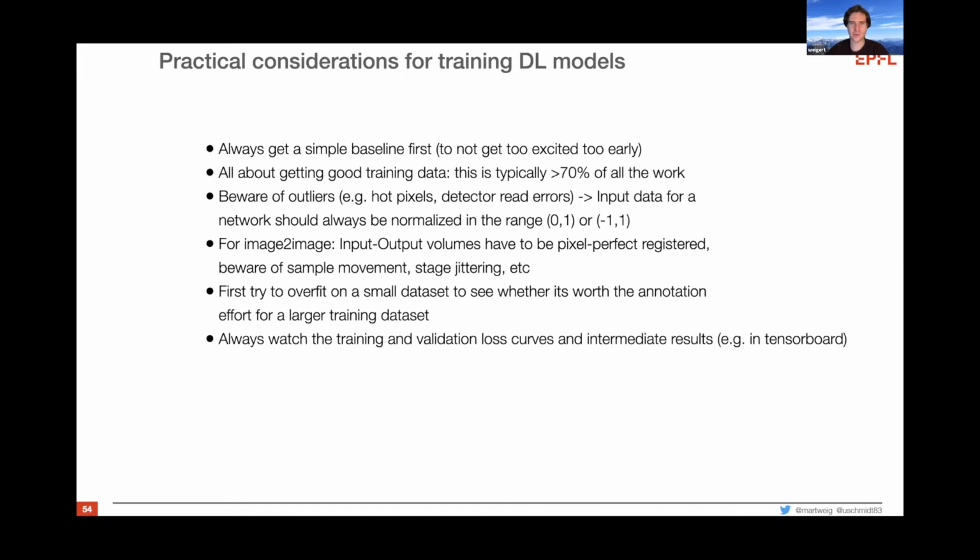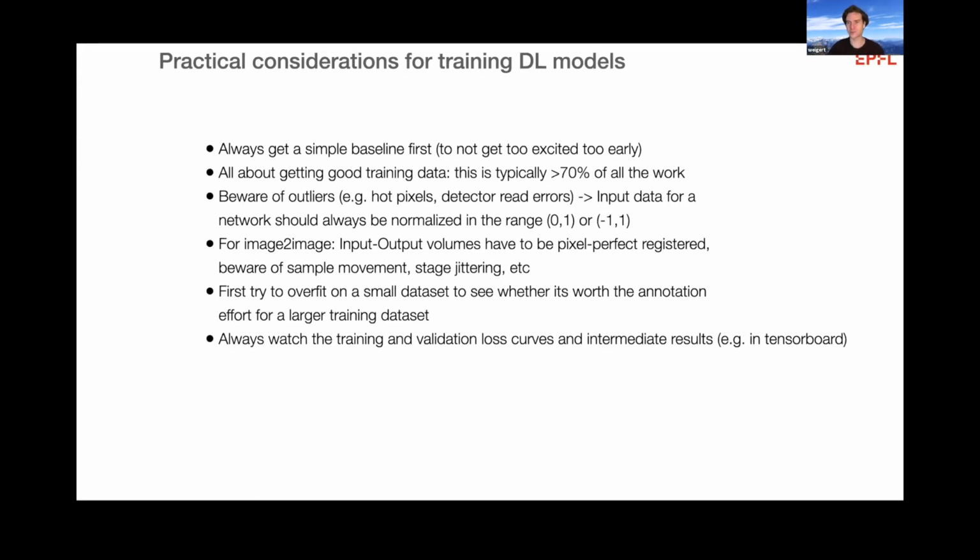What else I would recommend for StarDist annotation specifically in 3D is to first use a simple pixel-wise classifier to get some rough outlines and do a watershed on that, and then curate those as your input ground truth masks, because really annotating 3D is extremely painful. This is a shortcut that we now see in a lot of projects. And it actually works quite well, because splitting cells that are falsely merged is way easier than annotating every cell.